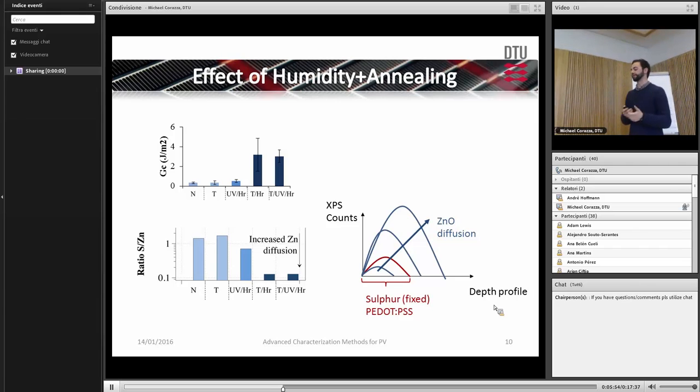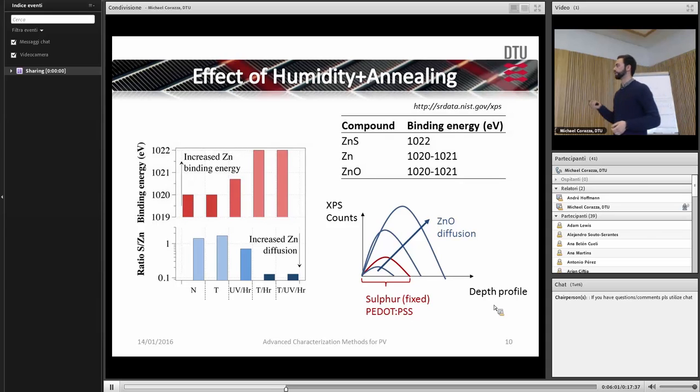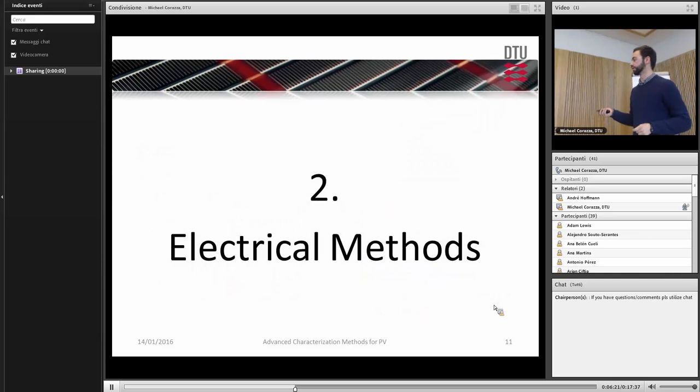Basically our device is stronger when we have a higher value of fracture energy. This also relates quite well with the value of binding energy. What we see is that when we have more diffusion, we also have a different binding energy, which indicates that we have some kind of bonding forming between zinc and sulfur. Quite interesting. So now I will move on to the second part of my talk, about electrical methods.